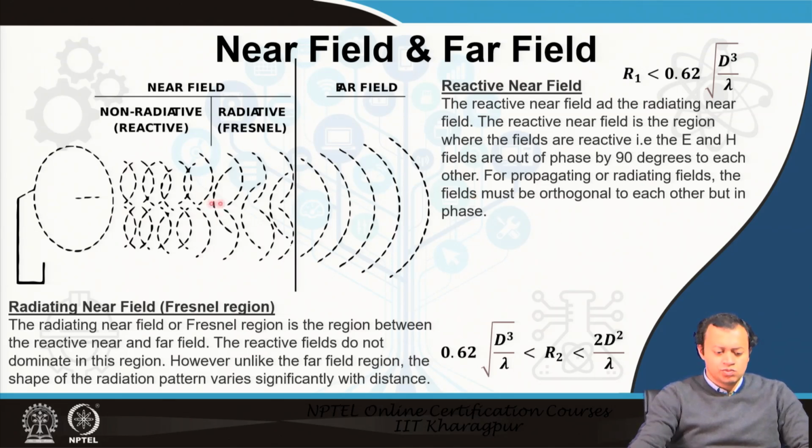What about this? Remember, I told you a few seconds ago that some amount of this light can, as an evanescent field, penetrate the forbidden region where it is not supposed to, because this does not play by the rules. They are out of phase by 90 degrees, and this is the distance. They are very close to one another, very negligible, very feeble strength wise, granted, but perhaps this 0.01% minority can actually be utilized.